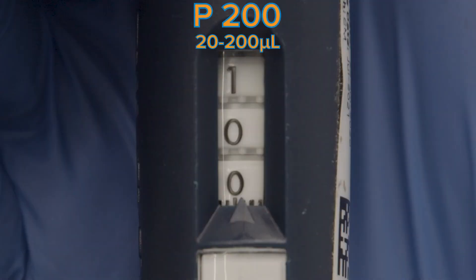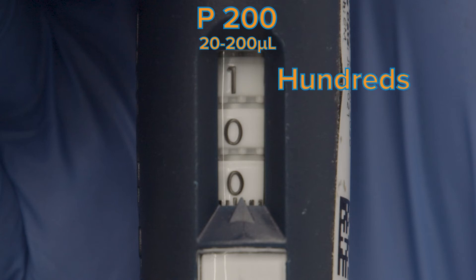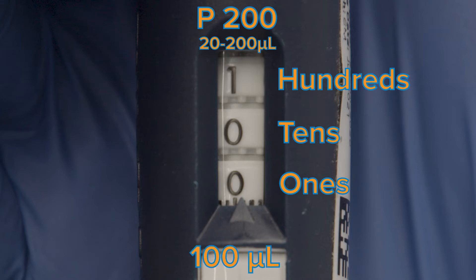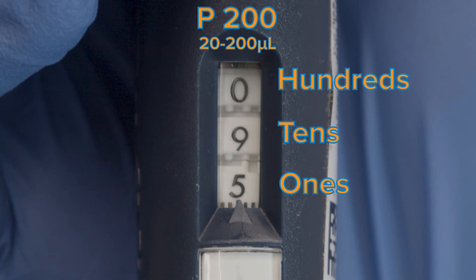For the P200, the first digit is hundreds, the second is tens, and the third ones. So, 100 from top to bottom would be 100 microliters, while 095 from top to bottom would be 95 microliters.